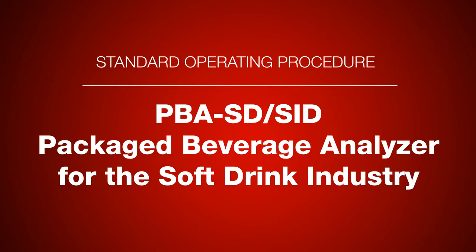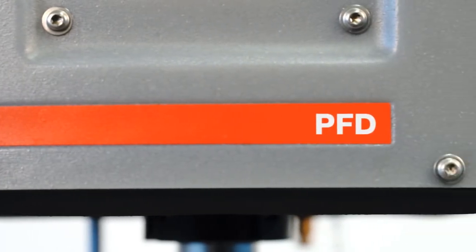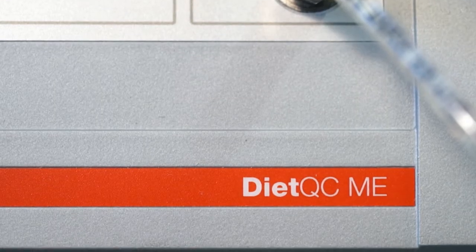PBASD and PBASID measuring systems are the ideal solutions for the final quality control of bottled beverages directly out of glass bottles, PET bottles, or cans.